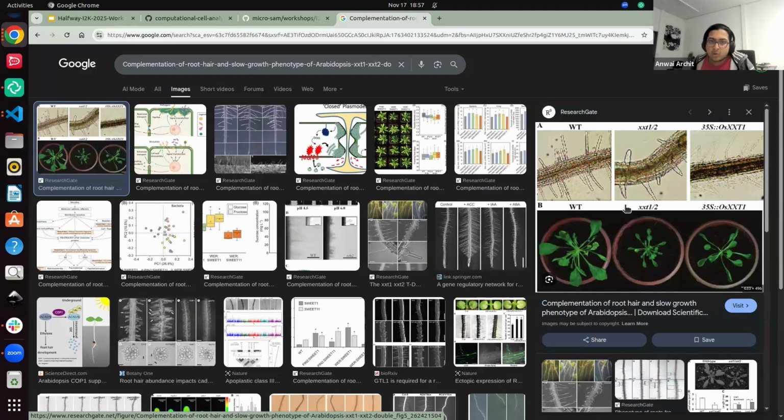That would be my way to approach these kinds of problems, wherein Microsam or Cellpose or any model does not work. Then you need annotations. If Cellpose or Microsam do a good job, take that as a starting point. Use Microsam to improve your annotations, and retrain any and every model. This would be the direction I would aim for.